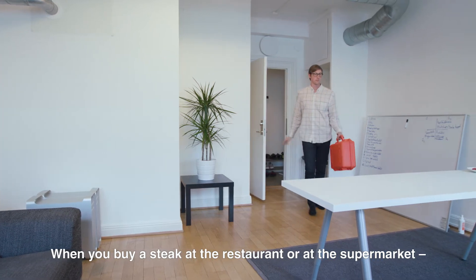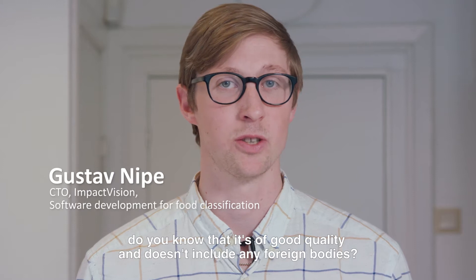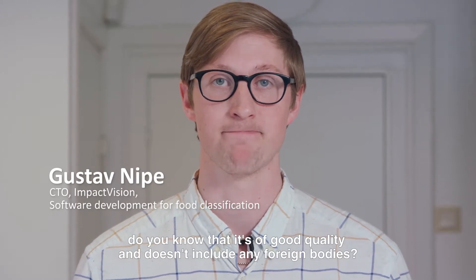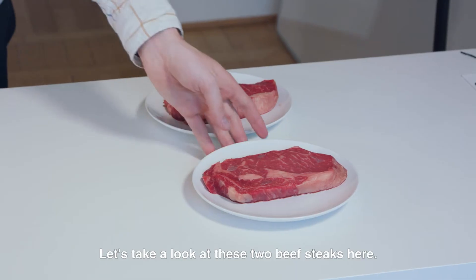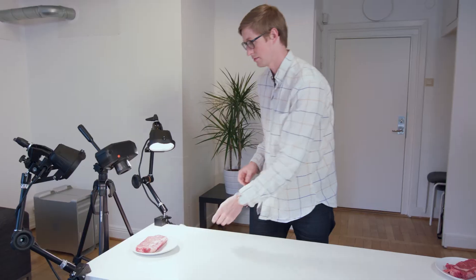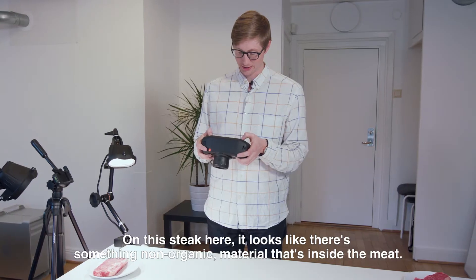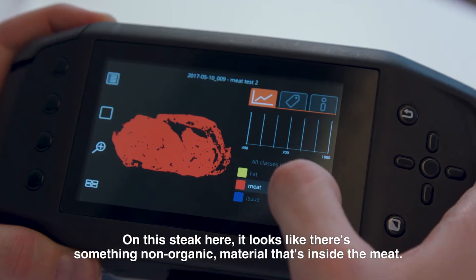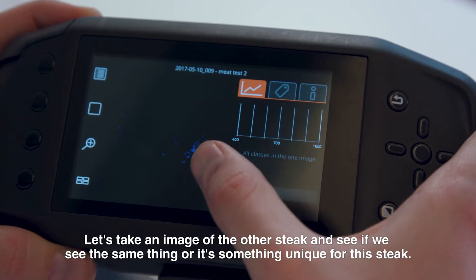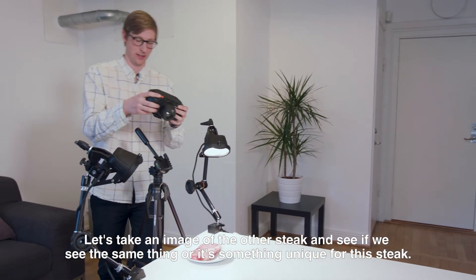When you buy a steak today at the restaurant or at the supermarket, do you know that it's of good quality and it doesn't include any foreign bodies? Let's take a look at these two beef steaks here. On this steak, it looks like there's some non-organic material inside the meat. Let's take an image of the other steak and see if you see the same thing or if it's unique to this steak.